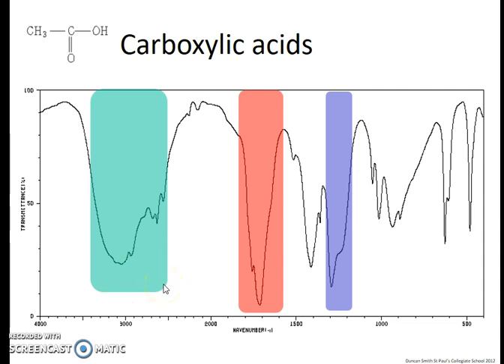And so you get this peak that I tend to describe as the big, fat, and ugly peak. It can take anywhere up to nearly a quarter of the width of the spectrum. It is incredibly distinctive. It's just such a big, fat, messy, ugly peak.